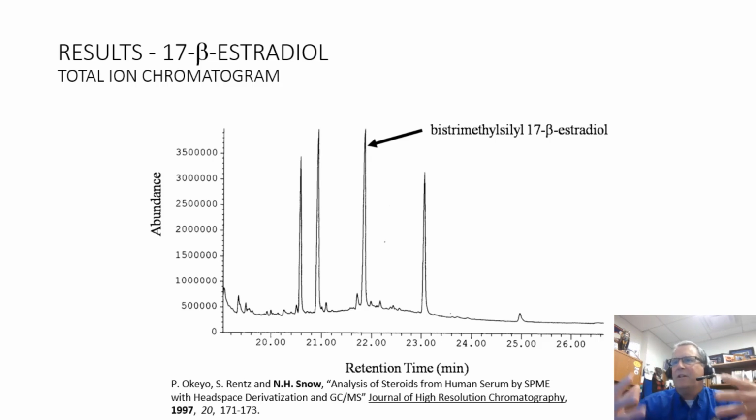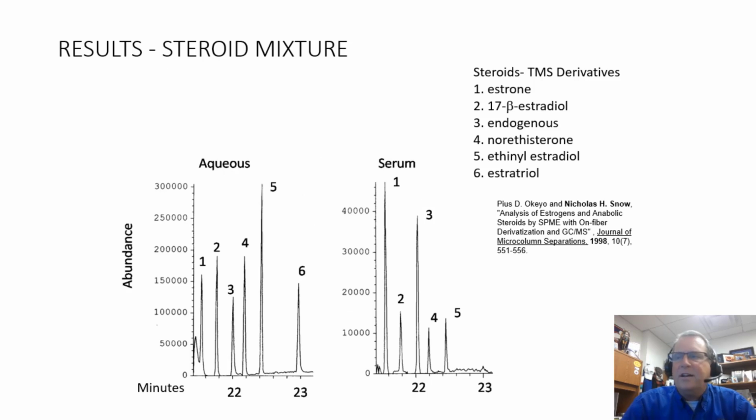And of course, that's also kind of a long literature now of SPME of drugs. And when I think about early green applications, SPME really greened up gas chromatography analysis, and that was a large part of the point. So here's a little bit later on, just some steroids that Pius and I did some years ago. But you think about this compared to, if any of you are out there doing solid phase extraction of steroids, you know how much fun that is. And we got SPME to work with this fairly well, and certainly greened it up. Now we can automate it. Back then, the automation was Pius, the graduate student. He did all the injections manually. Now, of course, automated SPME, and we were a part of bringing automated SPME and automated SPME derivatizing onto those nice rail autosamplers that you see everywhere.